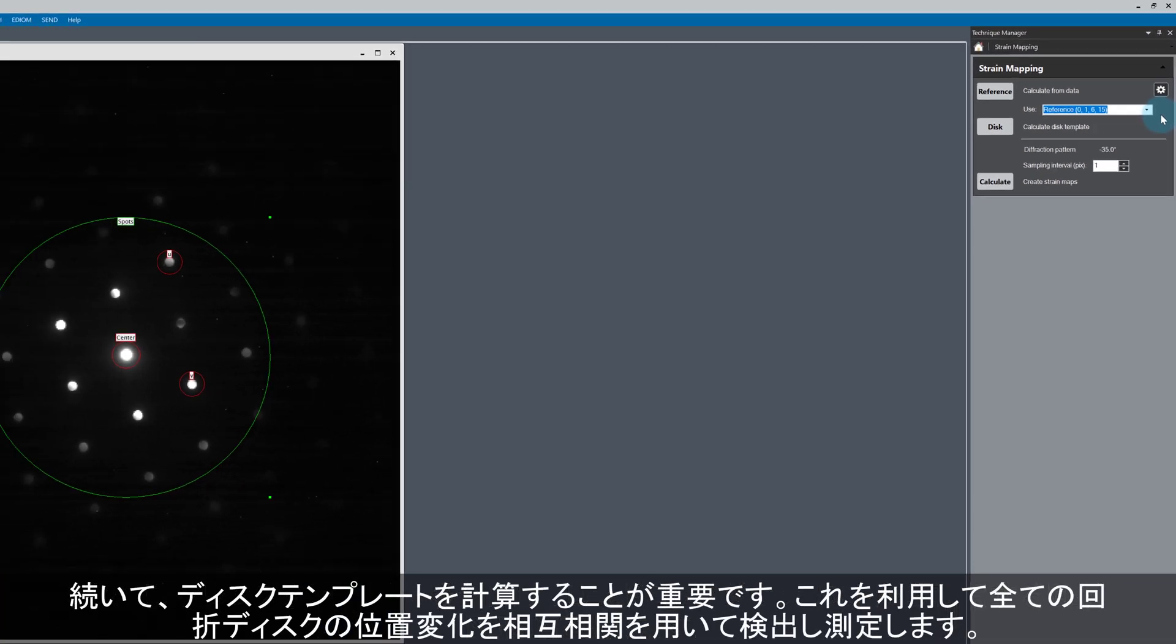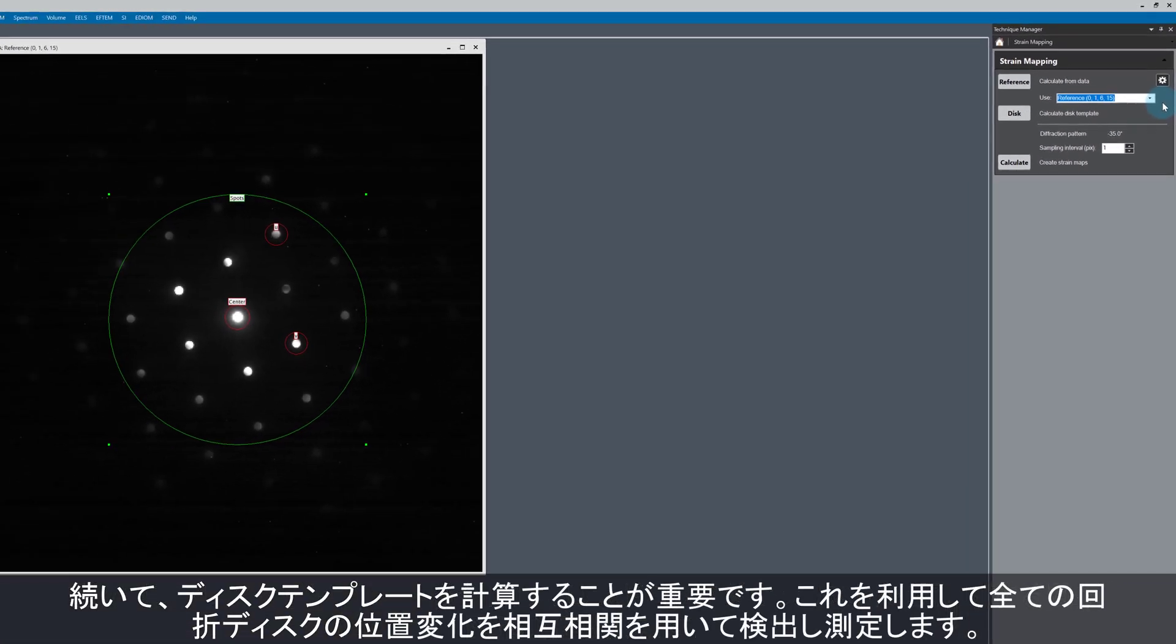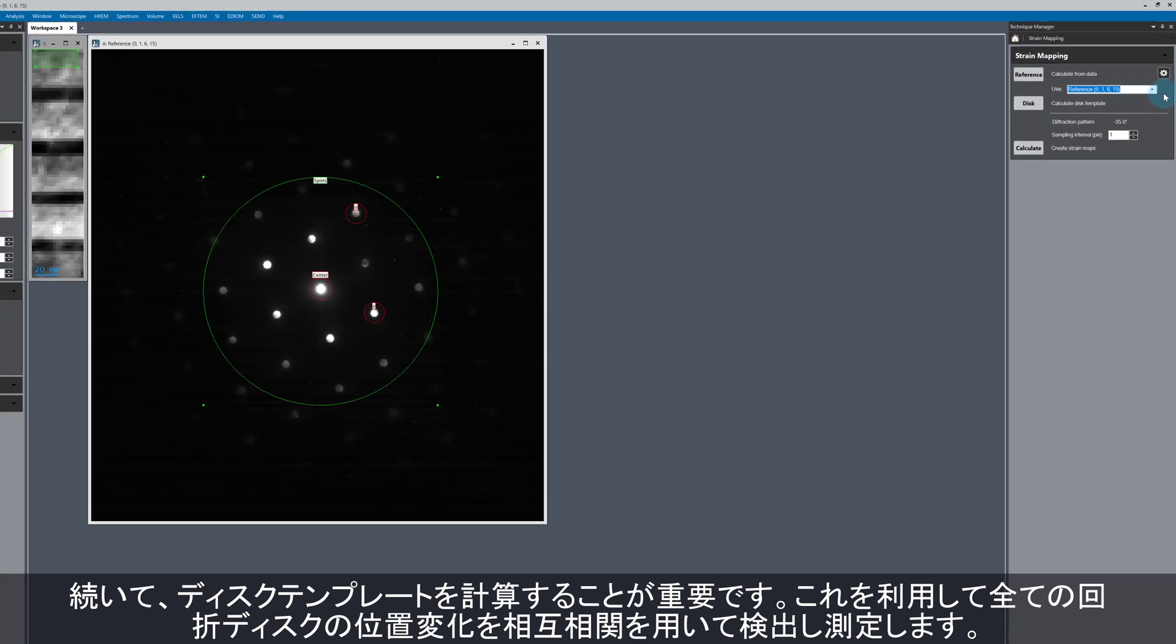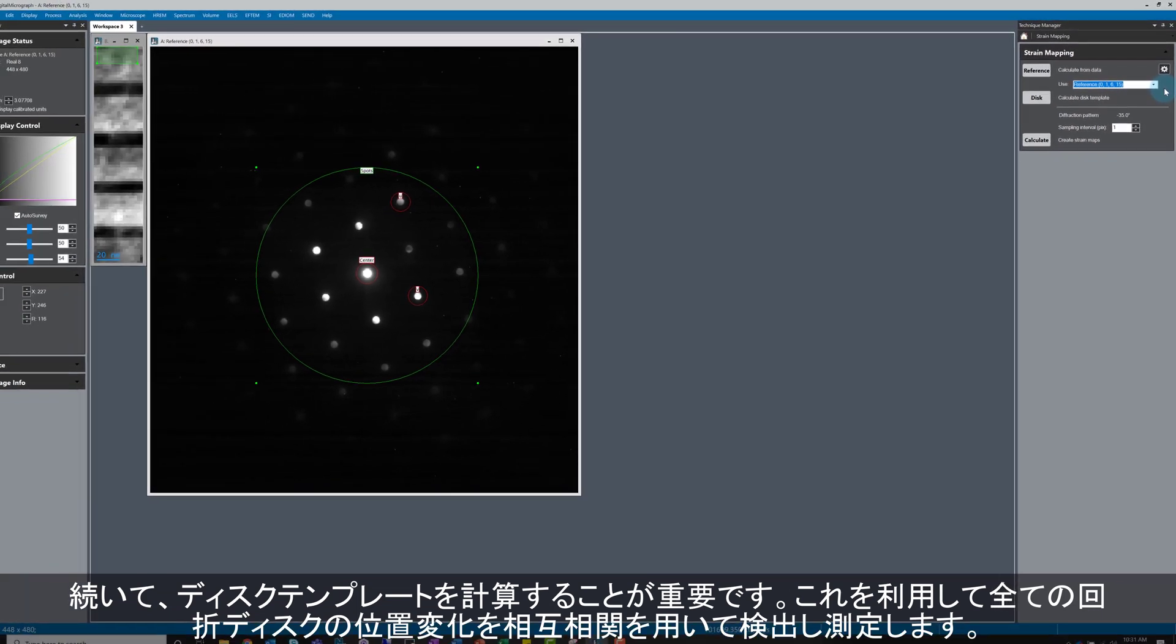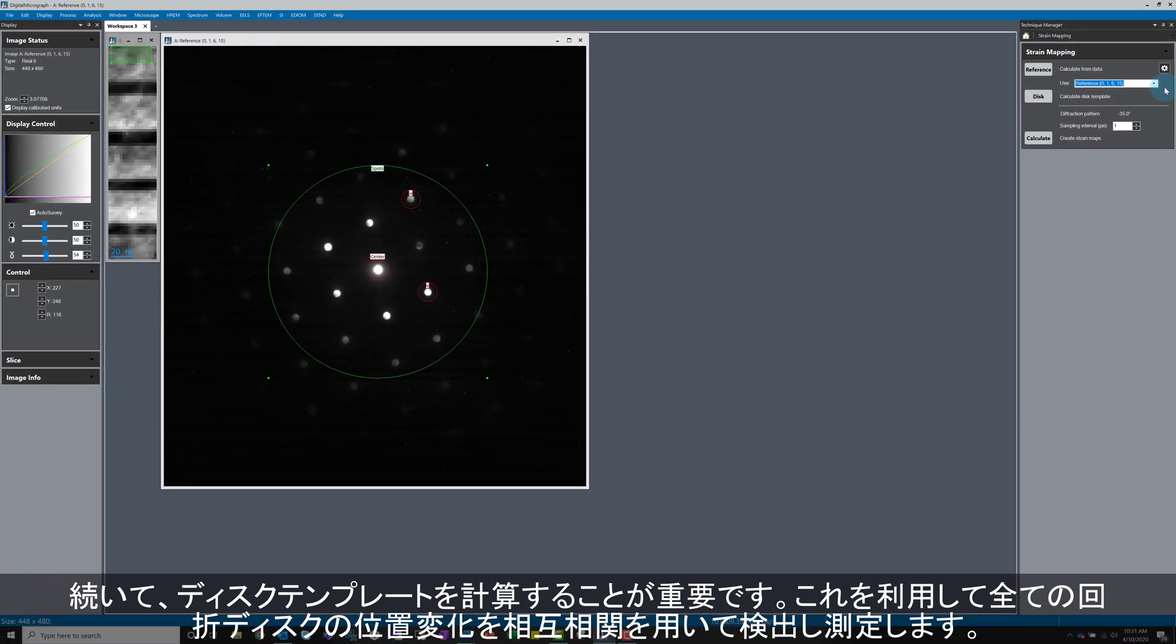That's all for the reference image, so now we're ready to calculate the disk template. This is a very important step as a disk template will be used later in the cross-correlation routine to find the position of all other diffraction disks and measure the change in their spacings.